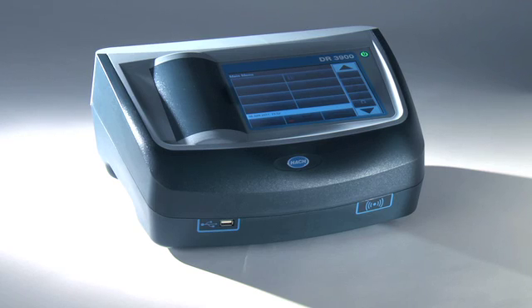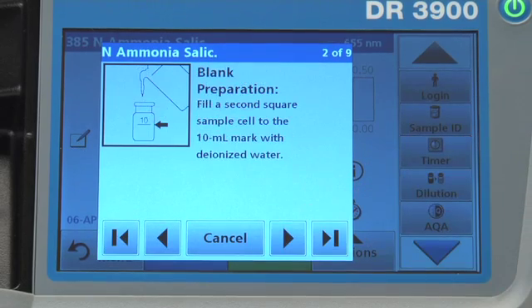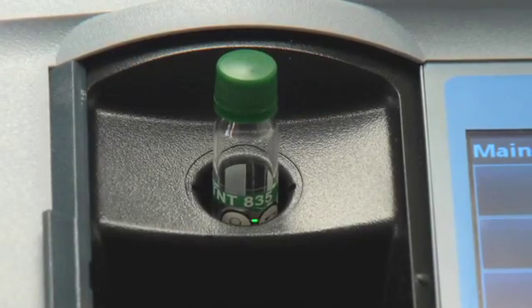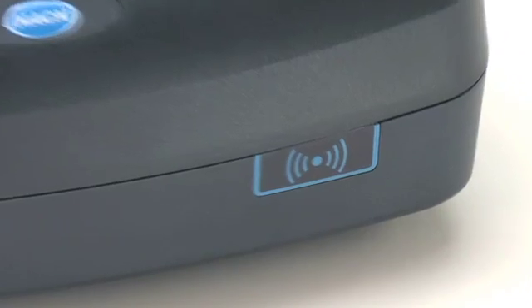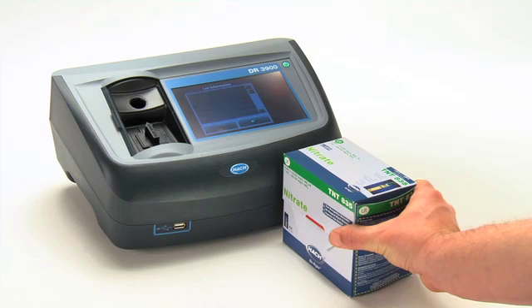The DR3900 has several features I want to tell you about. Guided procedure — this is a feature that walks you through the testing method, similar to a GPS telling you when to turn. SPIN technology eliminates false readings by taking 10 measurements and throwing out outliers. RFID technology is used to enable hands-free updates of calibration factors, kind of like an invisible barcode for your test method.